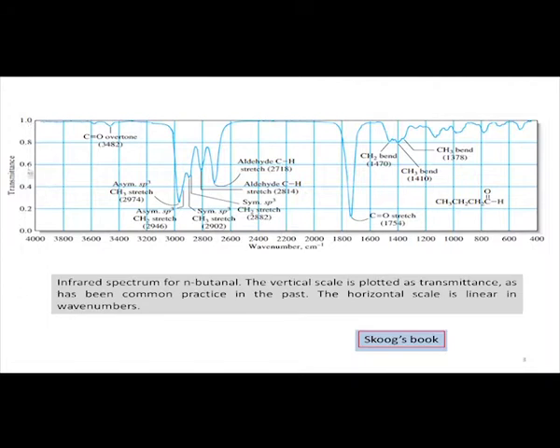So, what we record over here, unlike your UV visible spectra where we are plotting the absorbances, in this case we will be plotting the transmittance. When we plot this transmittance from 4000 to 400, we get the different peaks, basically the CO overtone. One such band we call the overtone band, which is at 3482 centimeter inverse.